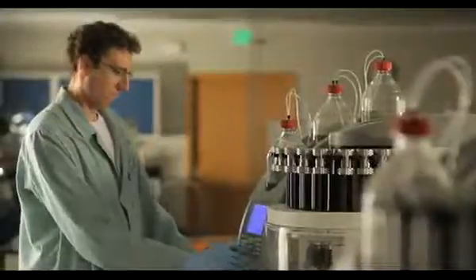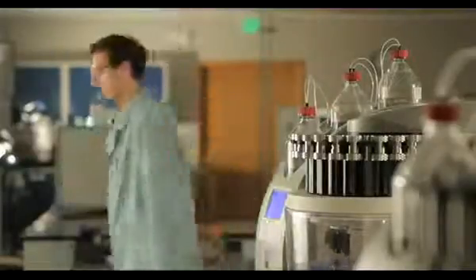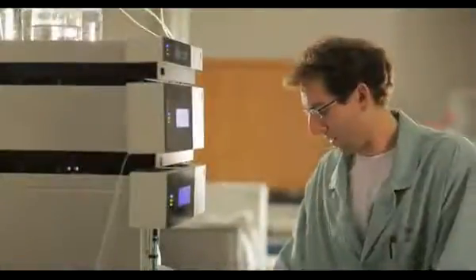Other extraction techniques can take up to 48 hours, but with Dionics, ASE extractions are typically performed in just 12 to 20 minutes with complete, unattended operation.